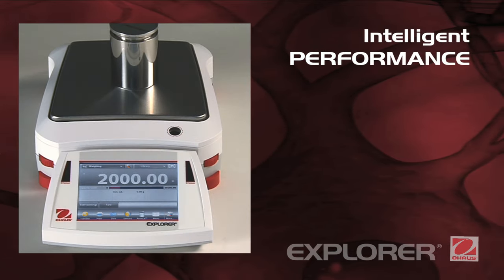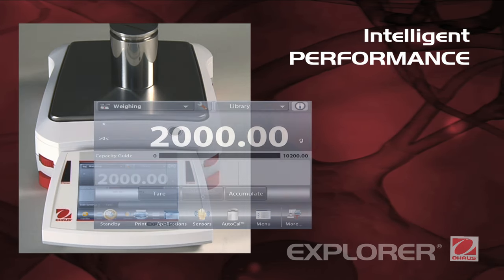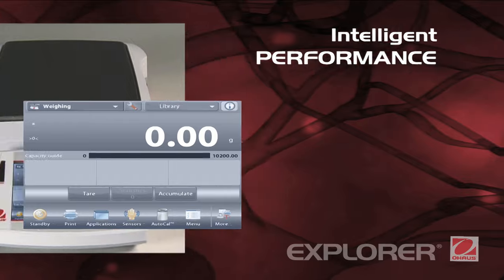Intelligent performance. Explorer delivers accurate results within seconds, improving operator efficiency, productivity, and throughput. Its superior linearity and repeatability specifications provide accurate, dependable results.